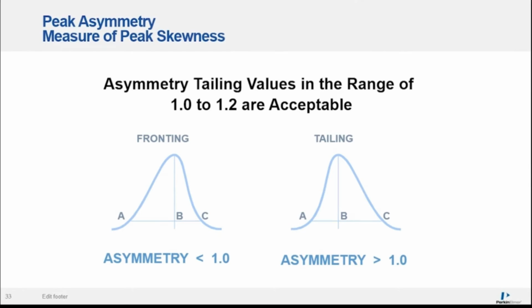So now that we understand a little bit about the terminology in chromatography, again, for system suitability, what we can do is define values for 1, 2, or all of these parameters. And then every morning you can run your standard, calculate these values, and see if they are in the acceptable range. If they are, your system is now suitable to run your assay that day. So again, this terminology helps us for method development, but it also helps us for routine operation.